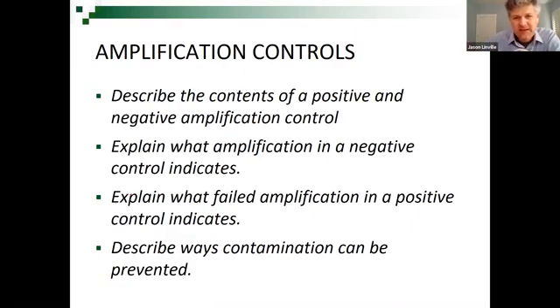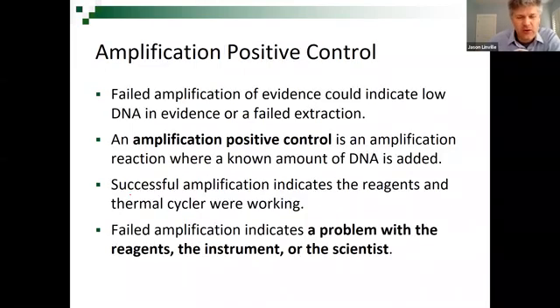Okay, actually take the time to visualize what's happening in the positive and negative controls, and then you'll better understand and be better able to explain what it means when your positive is negative or your negative is positive. Or I may ask you, what if your positive is positive? Well, that's what's supposed to happen. So what does that tell us? Okay, let's start with the positive control.